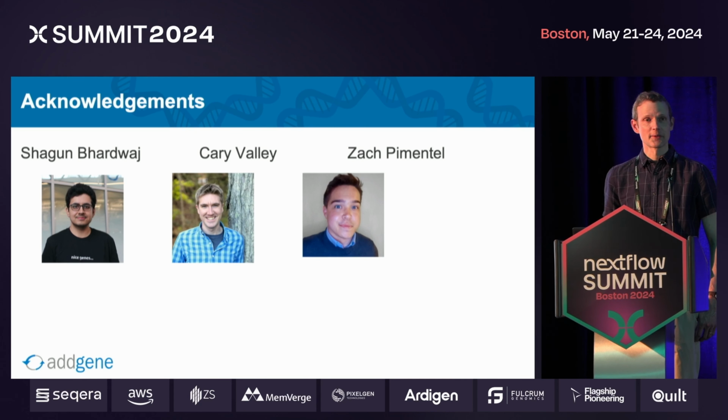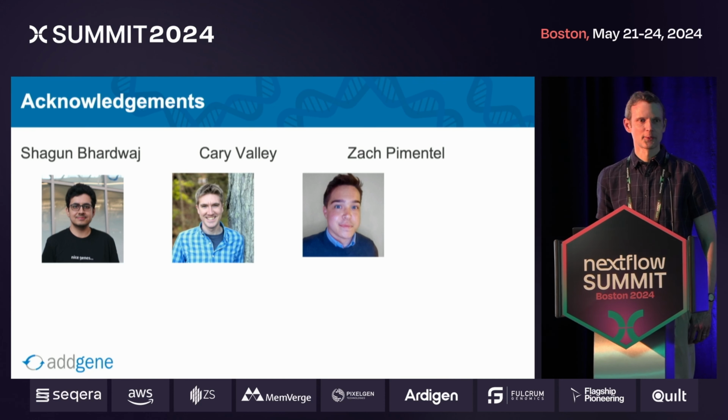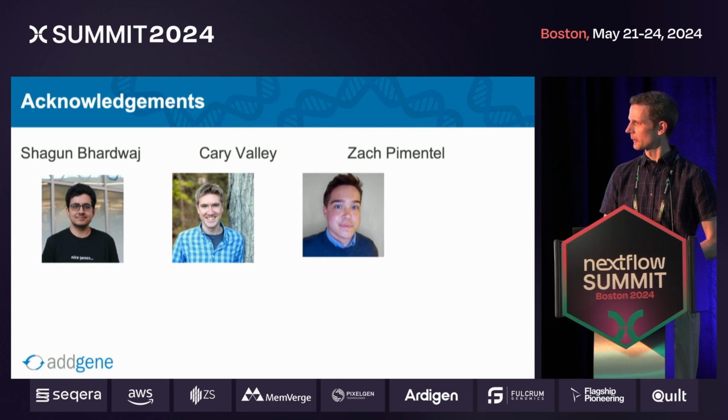Yeah, so there's a definite advantage to long read sequencing, and that's something that we're looking into. For our purposes, the advantage of the short read sequencing is really just the throughput, right? So we can do hundreds of samples all at once, and I think our quality control team is looking into how to multiplex with the long read sequencing, but yeah, we haven't made that transition yet.